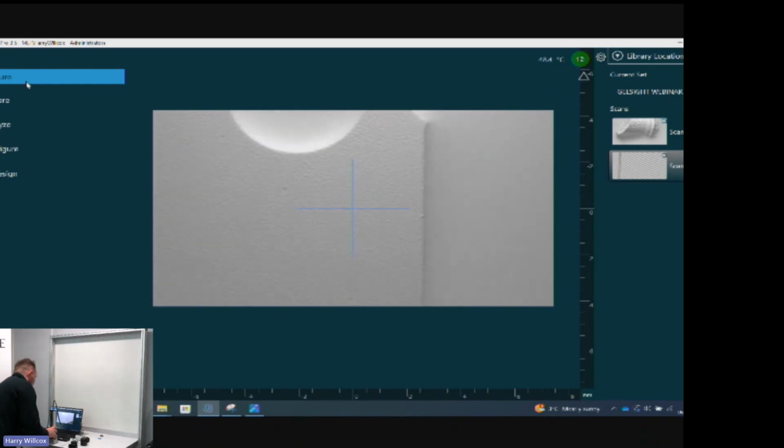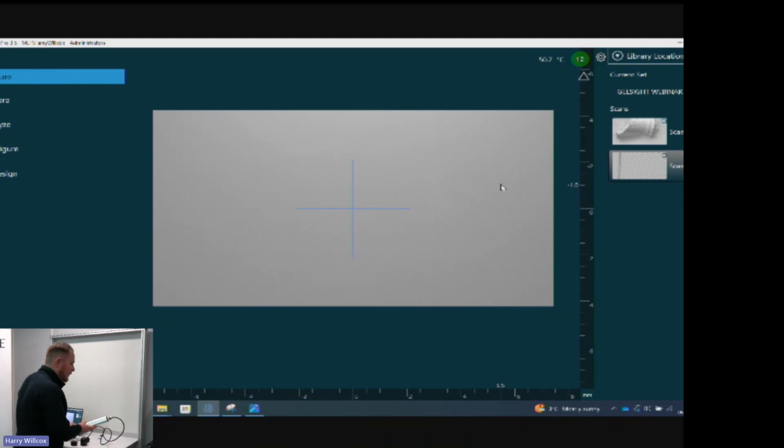So you can see here my through hole. It's amazing the texture you pick up with this Gelsight Max. But in the through hole area, and the area where I've not taken a scan, you can see that it stays this sort of matte grey colour. And the matte grey colour insinuates that we're not touching a surface. Whether I look at a transparent surface, like the screen of my phone, even though it's transparent, we'll still see a texture change. So we can tell the difference between when we're against the surface and when we're not.